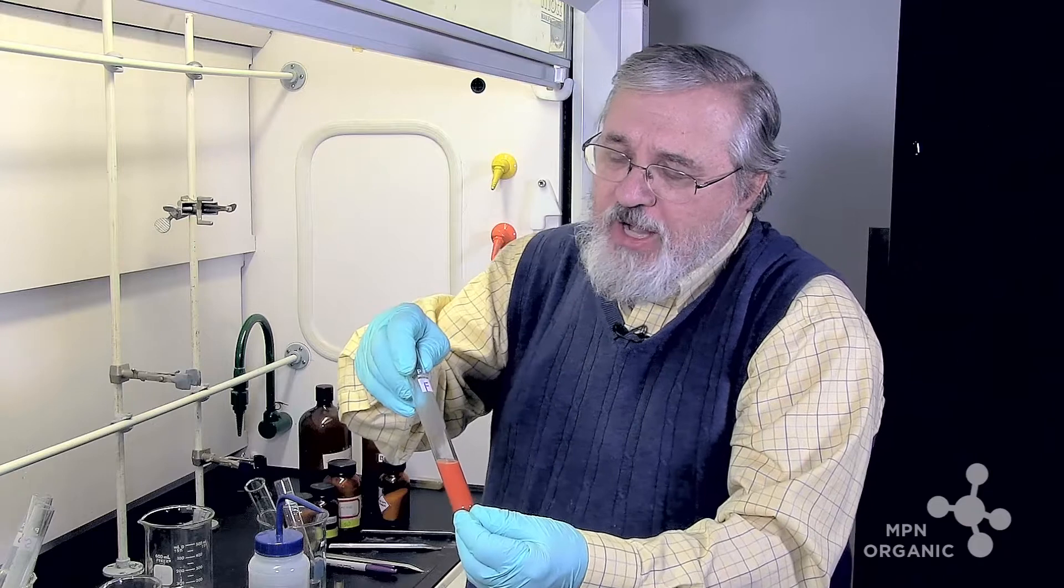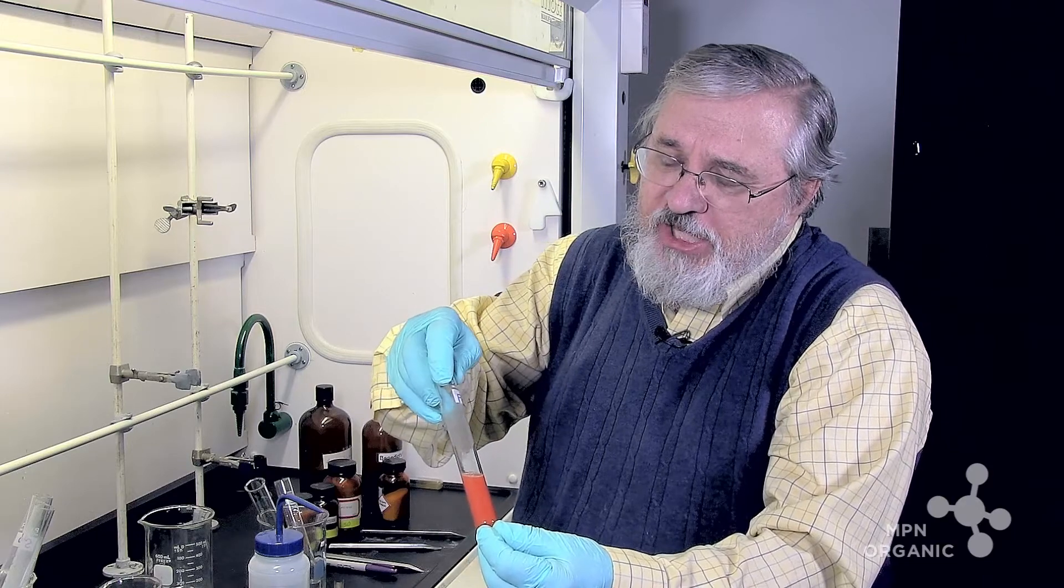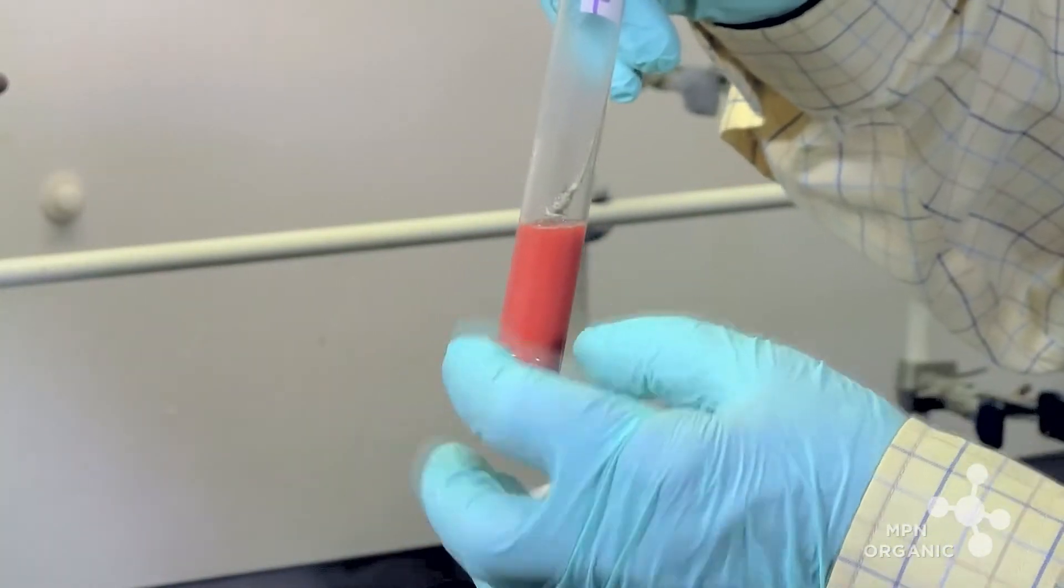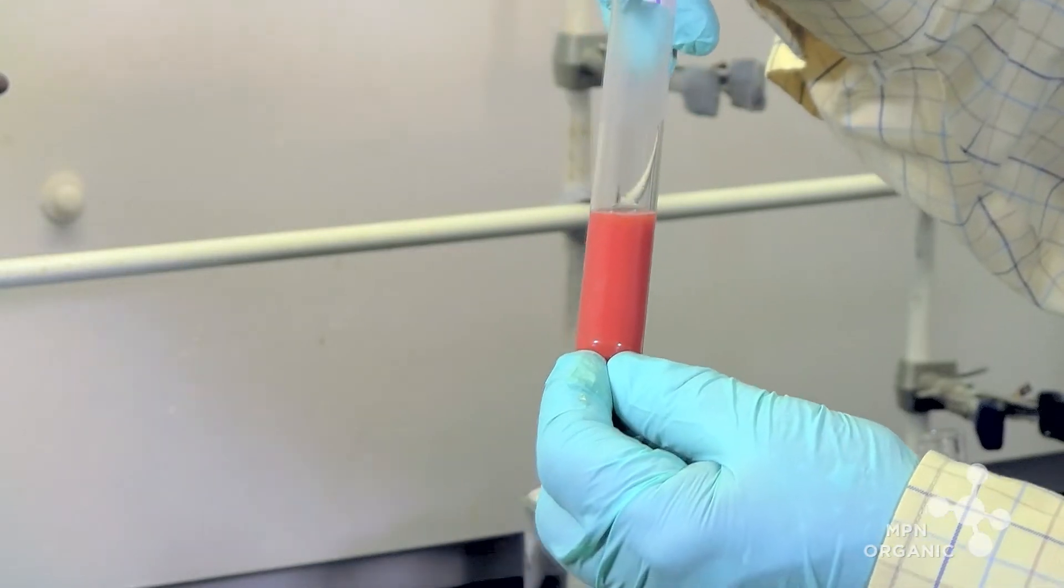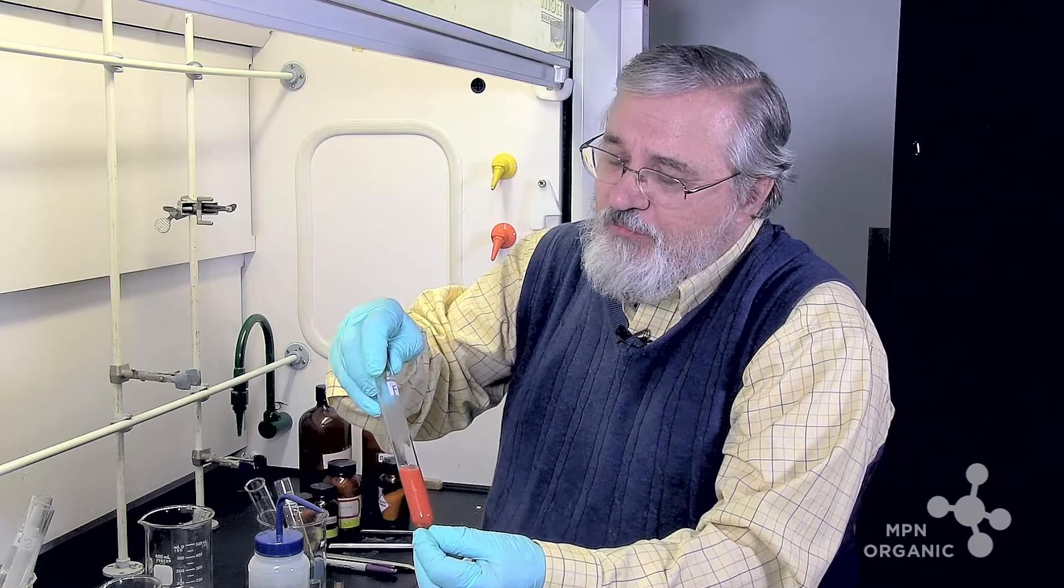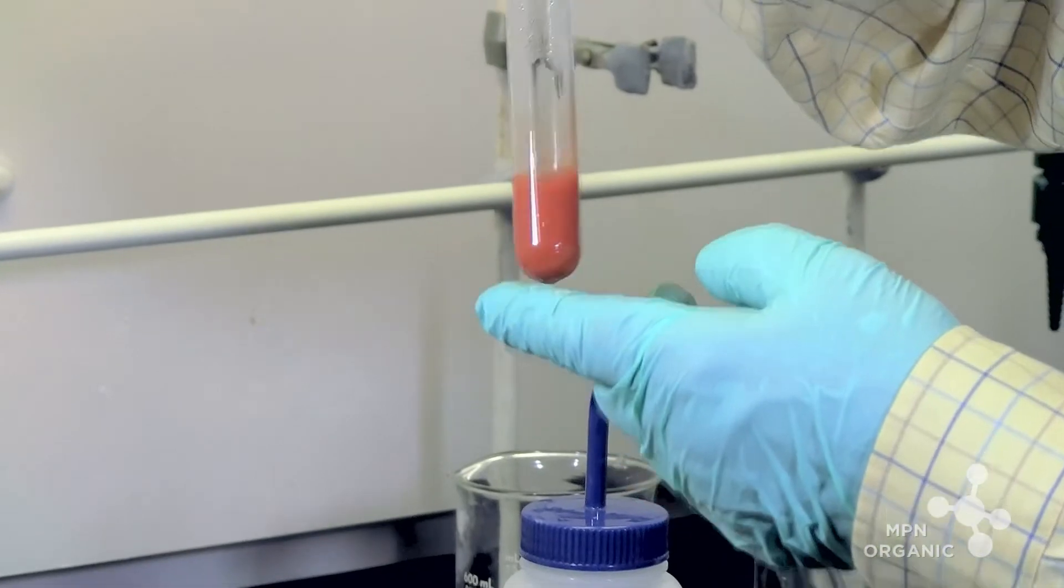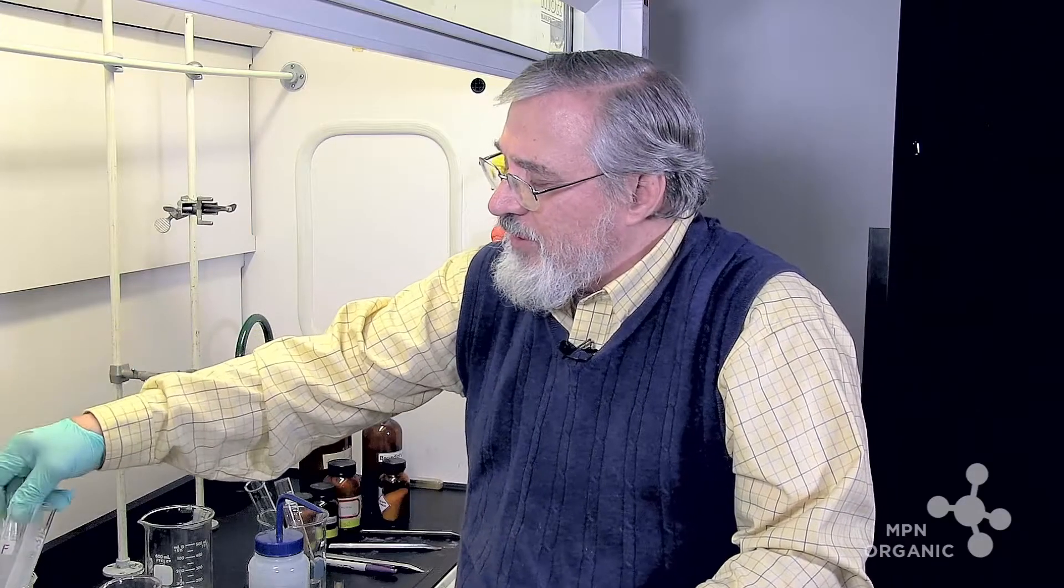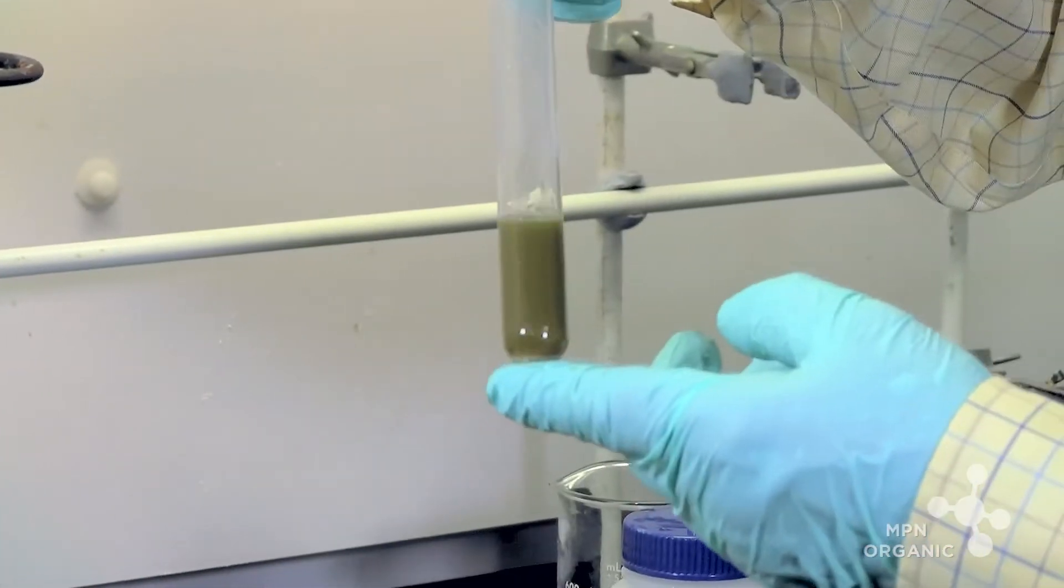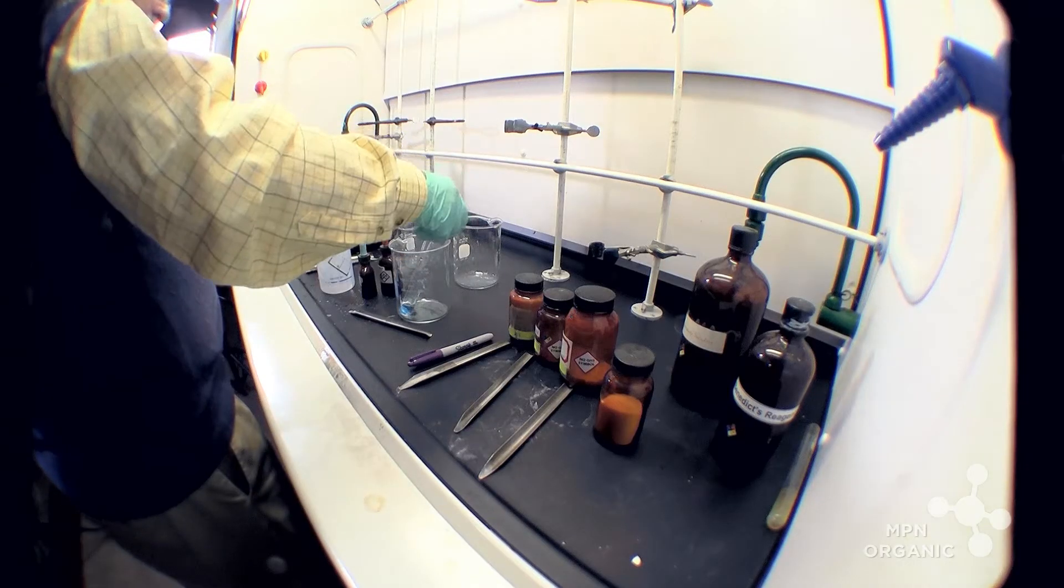That's the copper one oxide precipitate that's formed. So we say that copper two ion has been reduced to copper one ion. And this change is very evident from the blue to orange color. This indicates that fructose has reduced copper two to copper one. Therefore, we call fructose a reducing sugar. You can see here glucose is almost the same.